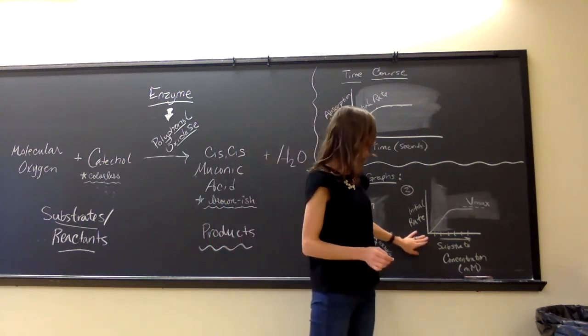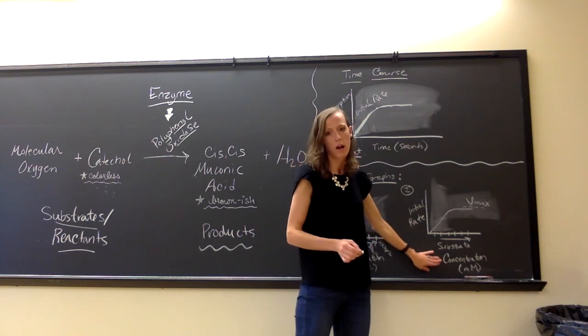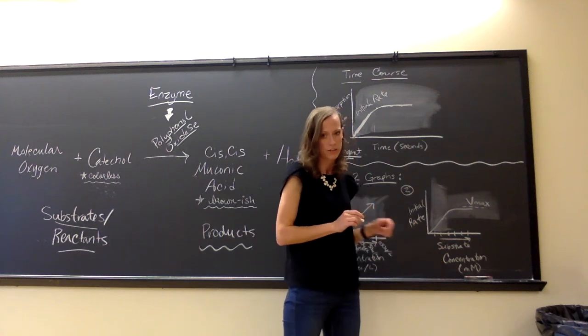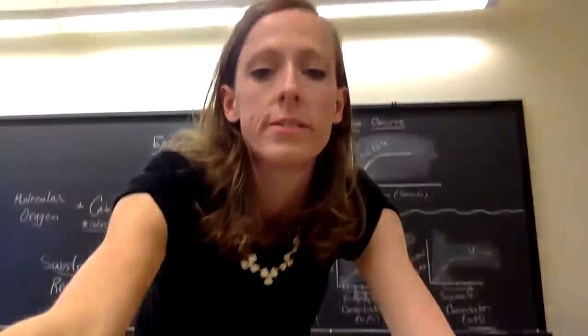And the second graph would be with diluted substrate concentration, so the catechol. Same process, we're using different dilutions of catechol and one single concentration of the enzyme, polyphenol oxidase. Okay, so I hope that all makes sense.